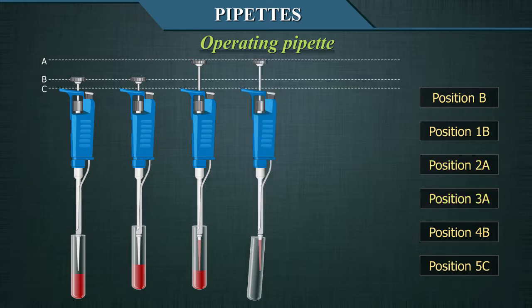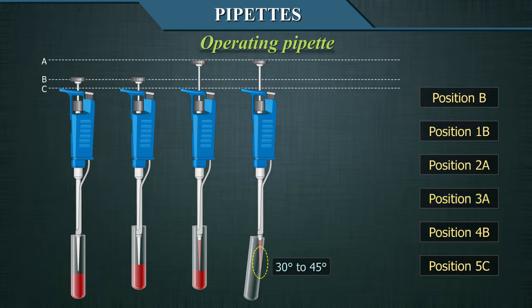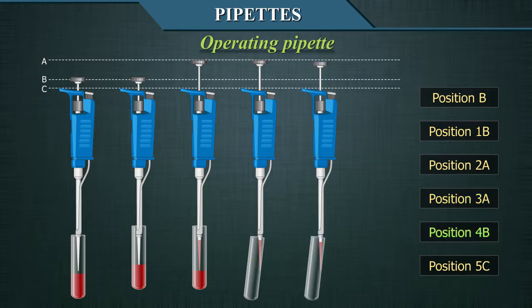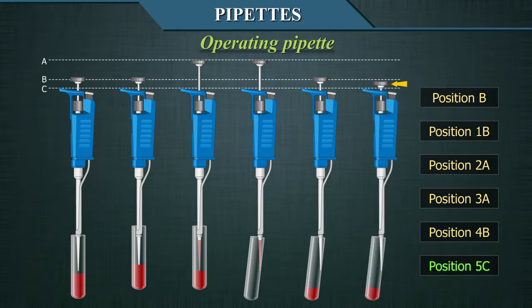To release, place the pipette's tip against the wall of the receiving tube. Verify that the angle formed between the pipette's tip and the wall is between 30 and 45 degrees. Dispense the contents of the pipette by pressing the plunger gently but firmly until reaching the first limit, position B. At all times, maintain contact between the pipette's tip and the wall of the receiving container. Gently slide the tip against the inside wall at 8–10 mm from the tube edge to ensure no drops of liquid remain on the pipette's tip.